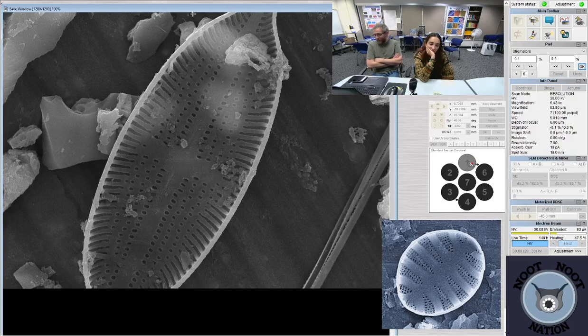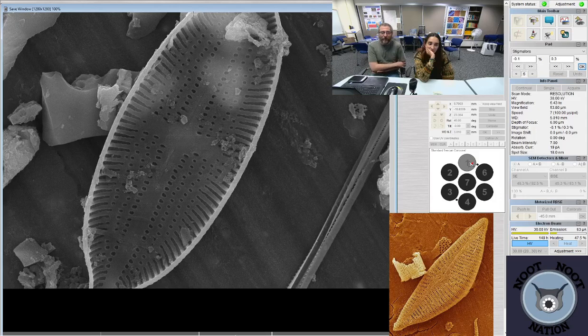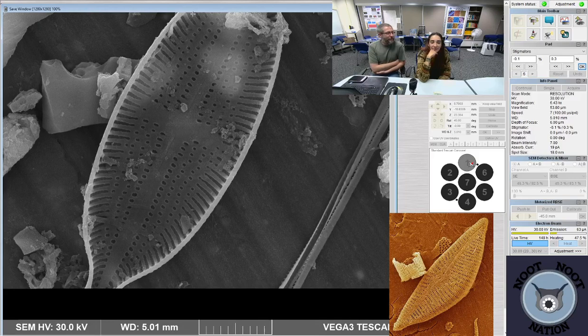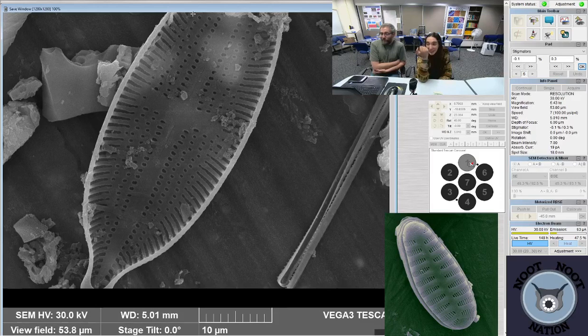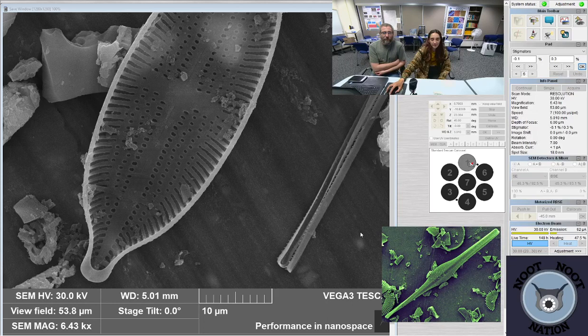Yeah, the detail on this diatom is actually pretty amazing. And if we could see the outside of the diatom instead of the inside, you'd probably be even more impressed, because the pores on this thing are amazing on the outside. Why don't we look around and see if we can find an external view? There's this one, and maybe the other one. Odds are we'll find an external view. Then we can get super close and take a super close photo of the pores. Whatever you want.